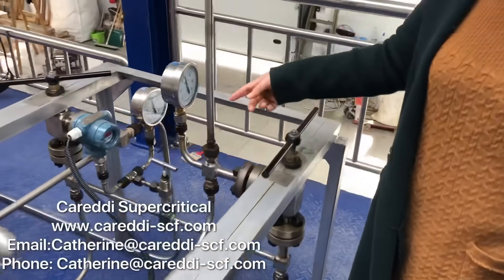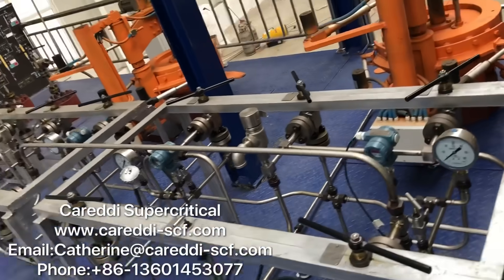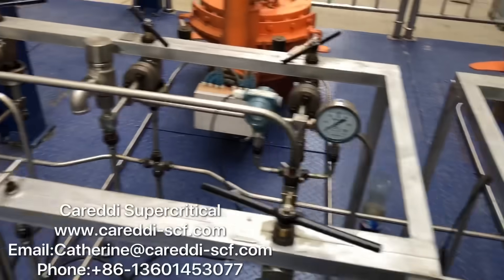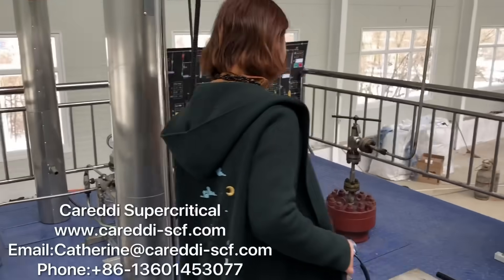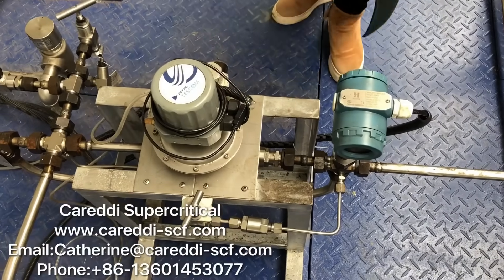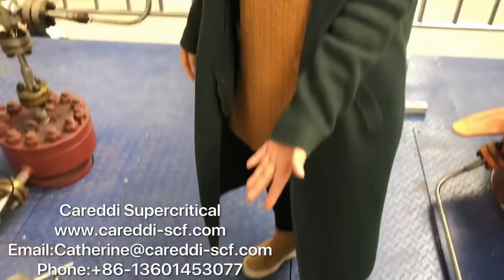There are pressure meters to show the pressure of the extractors. This is the pressure regulator valve. It will receive the signal from the computer and adjust the pressure of the extractor automatically.